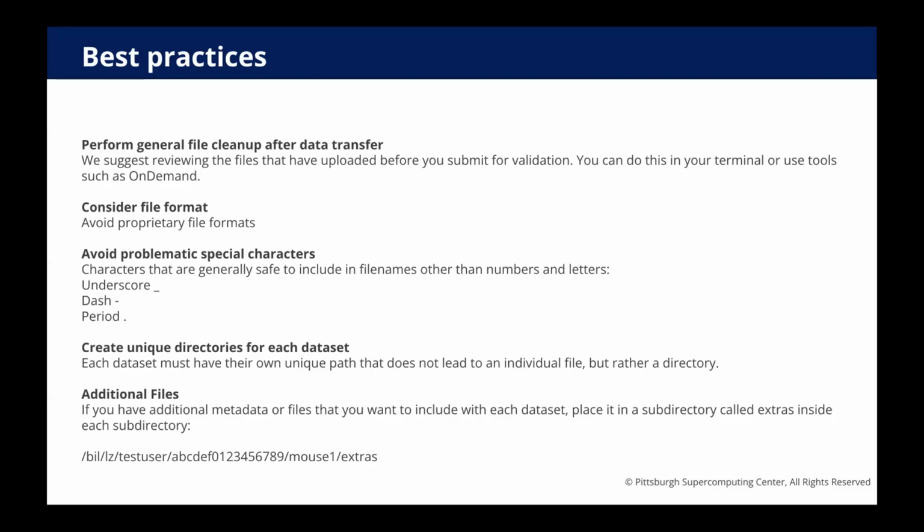Also consider that file format is important, because we do value making sure that the data that you contribute is easily accessible to everyone. So we may ask that you transform any files that are in proprietary formats to an open format, and what we really recommend is usually a TIFF file. And if that doesn't work for you, please let us know and we can try to figure out the best format for your images.